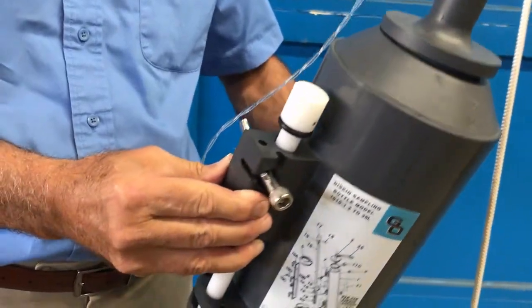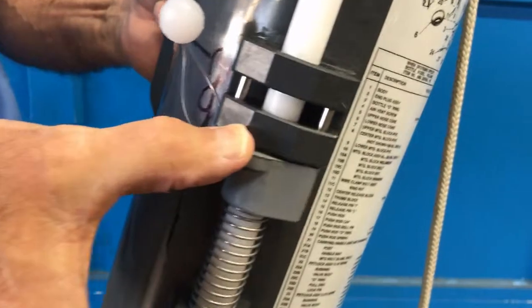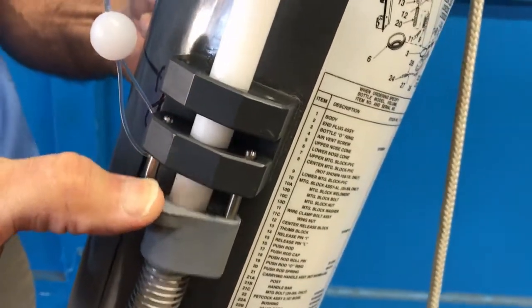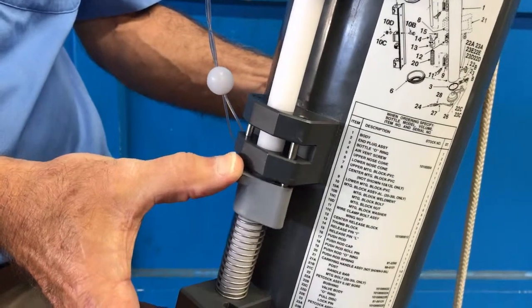Just above the spring in the middle of the pushrod there is a thumb block which supports an L-shaped pin for mounting the lanyards and a straight pin for mounting an extra messenger for multi-bottle sampling.